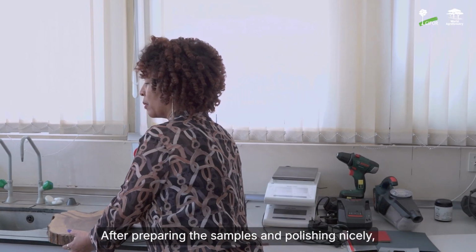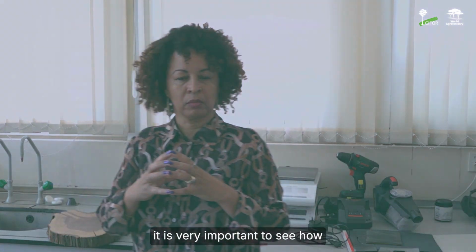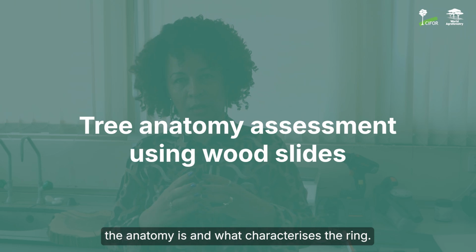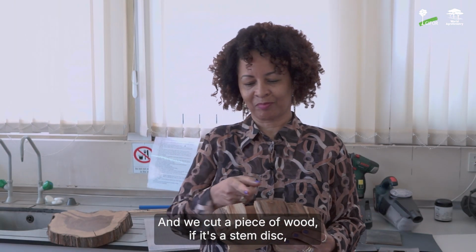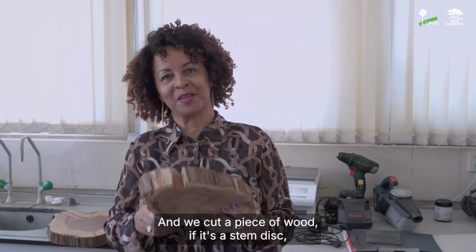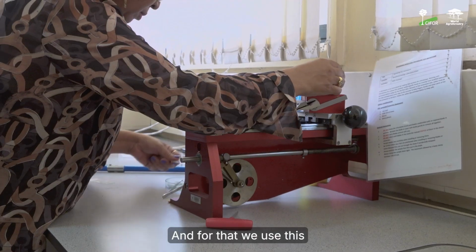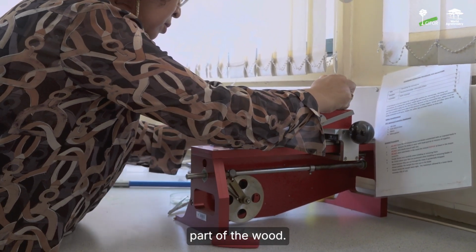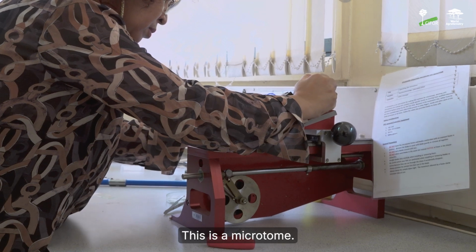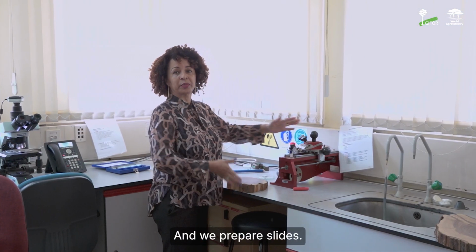After preparing the samples, polishing nicely, it's very important to see how the anatomy is, what characterizes the ring. We cut a piece of wood, if it's a stem disc, to look at the anatomical structure. And for that, we use this part of the wood. This is a microtome. It has a very sharp knife, and we prepare slides.